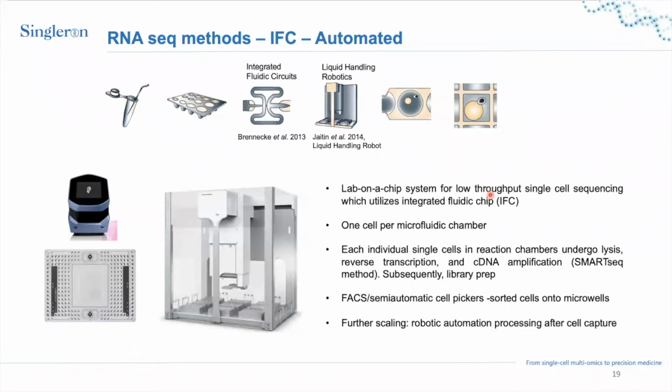After introducing integrated fluidic circuits, people were interested in automating this. But again, this automation was based on SmartSeq, and they used FACS sorted cells to start with. And it is possible to scale up a little bit by using these automated systems.